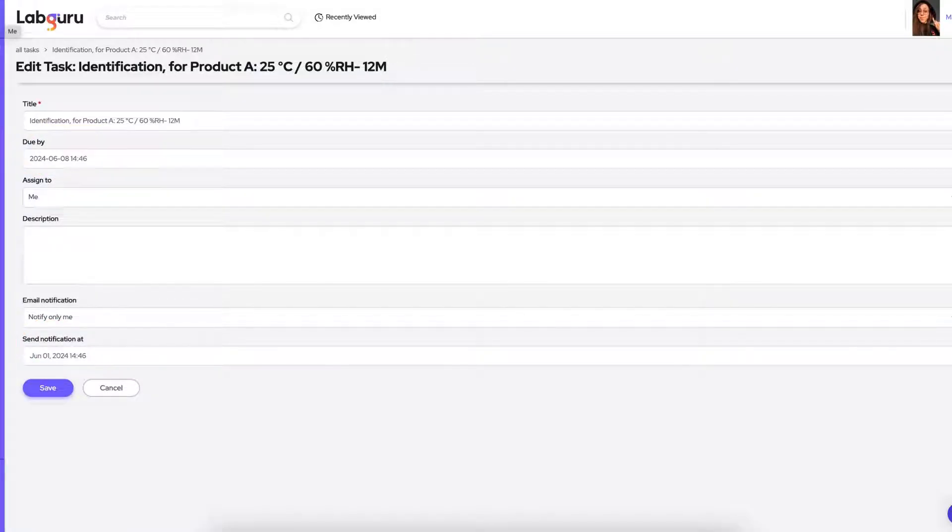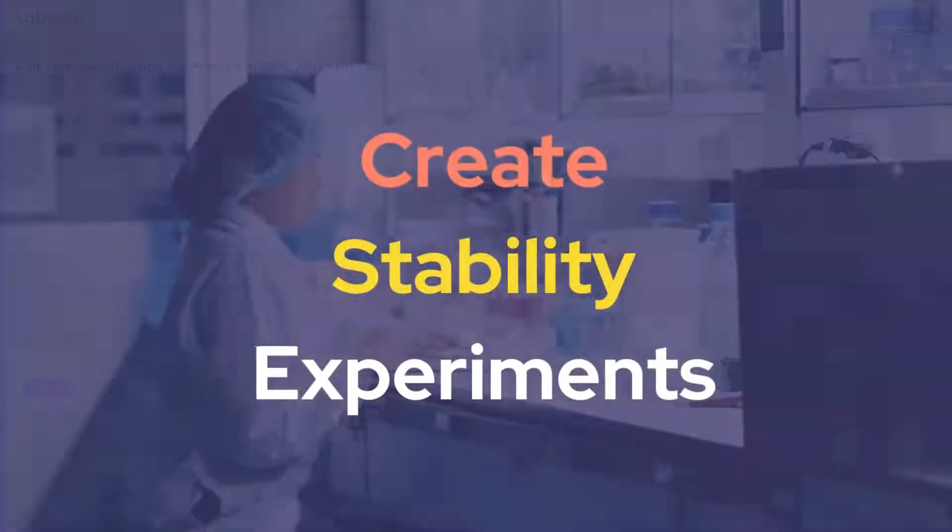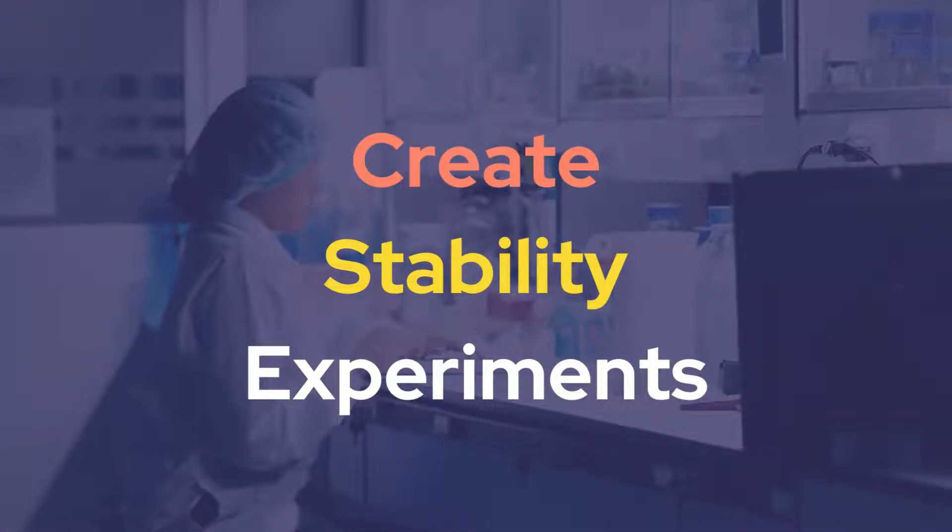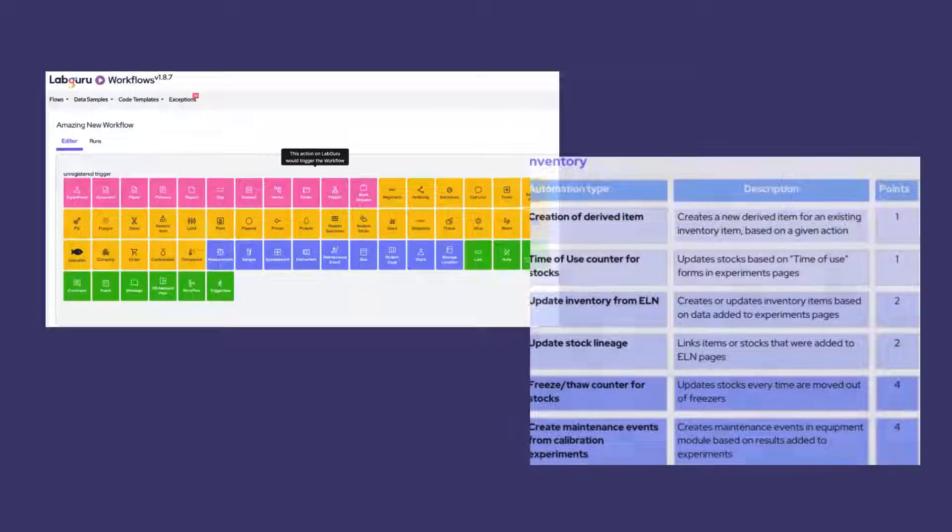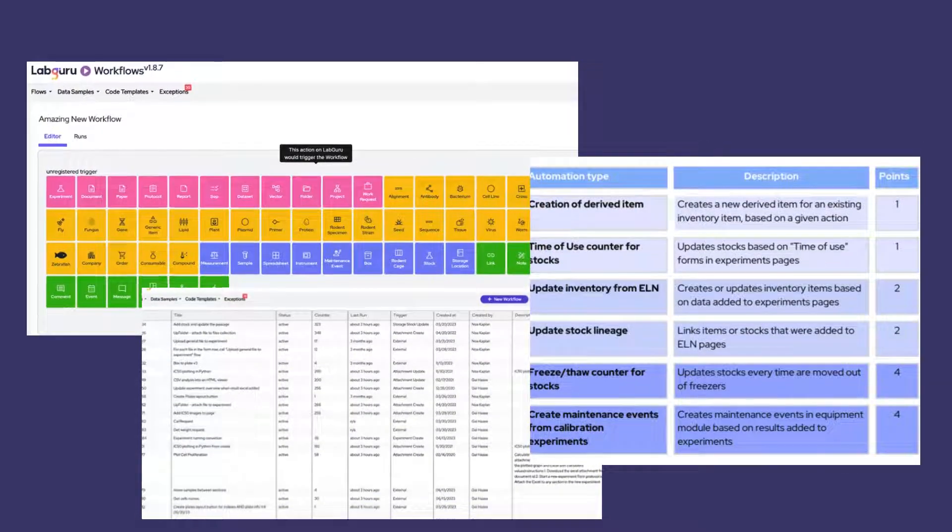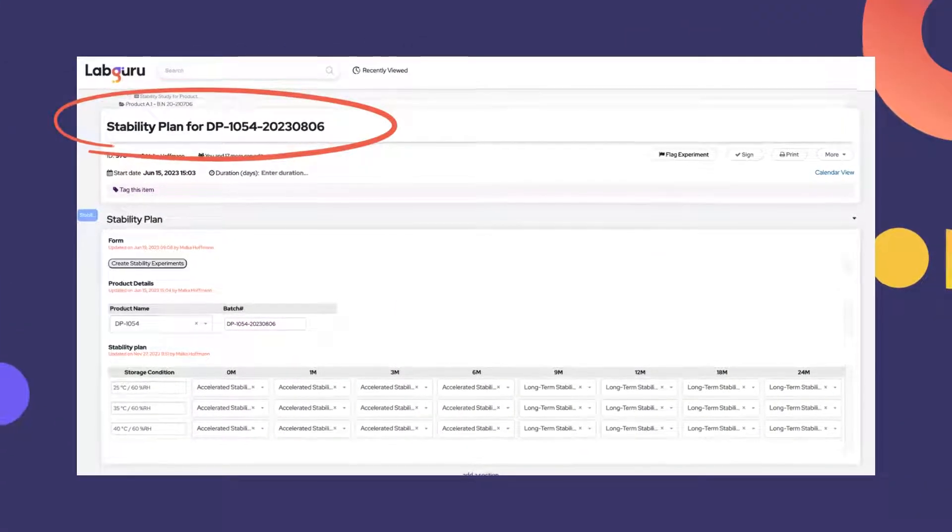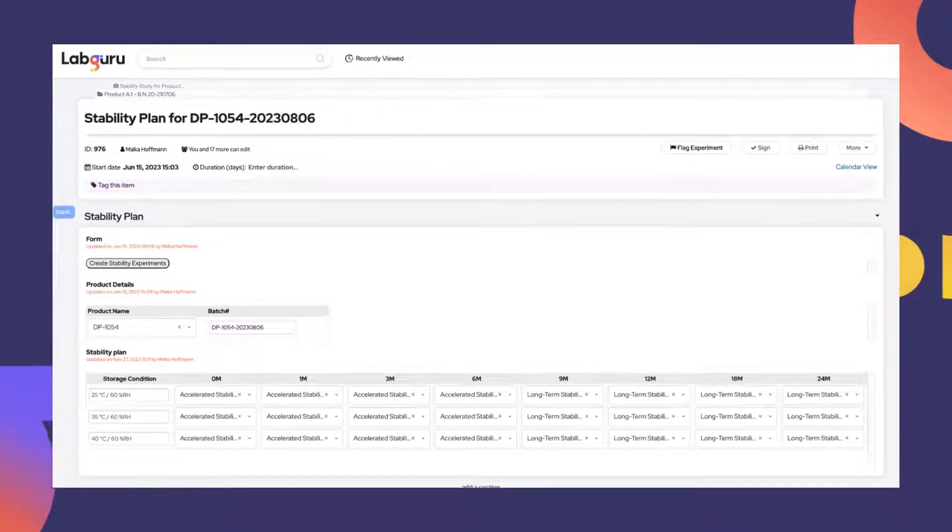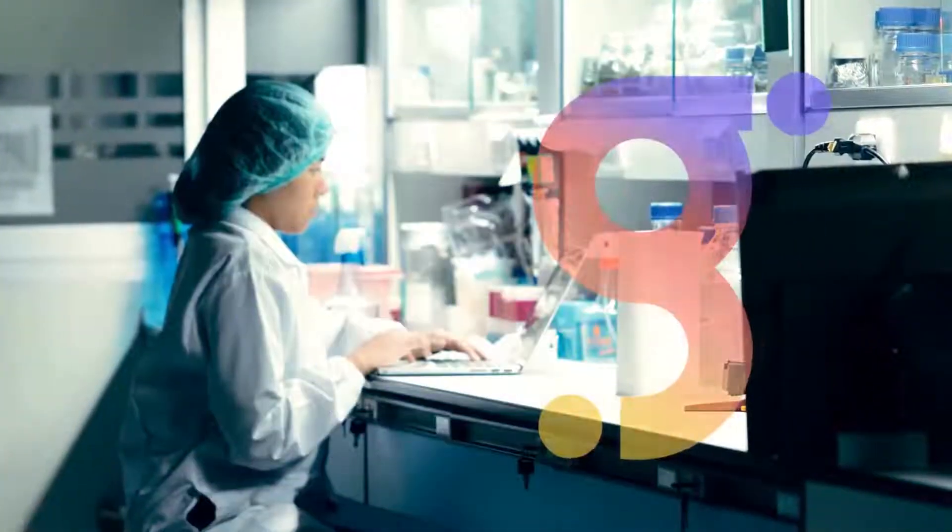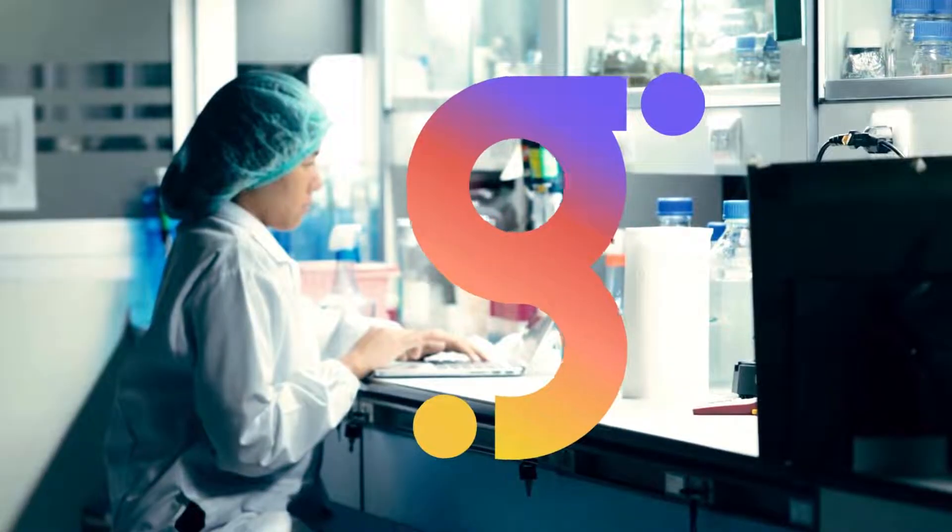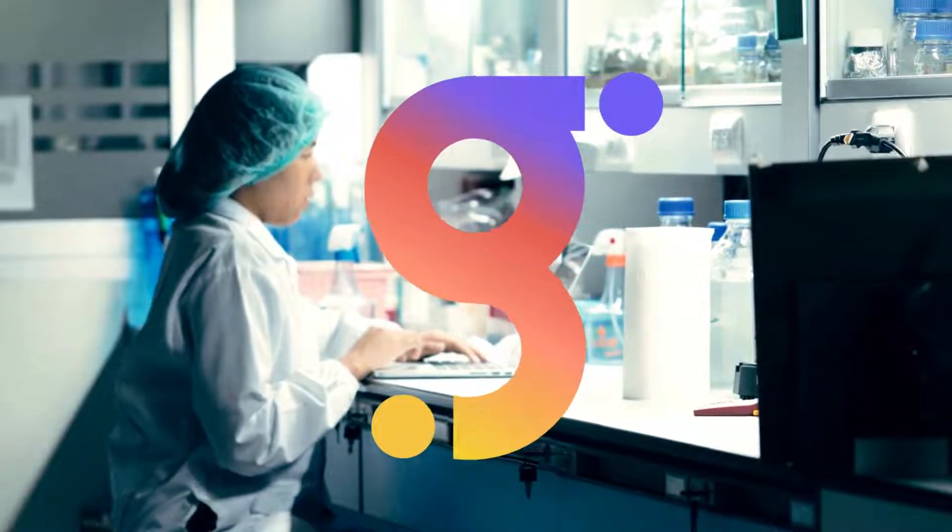Today we learned how to plan ahead and automatically create stability experiments, stocks, and tasks using LabGuru's automation capabilities. This automation will enable you to simplify the process of conducting stability studies, providing a seamless experience within the LabGuru platform.